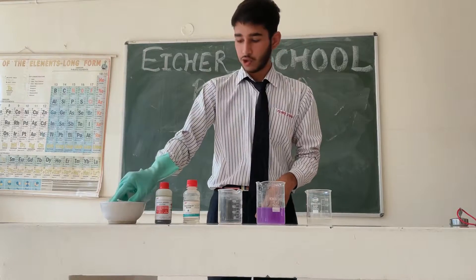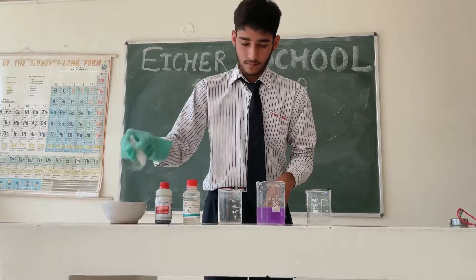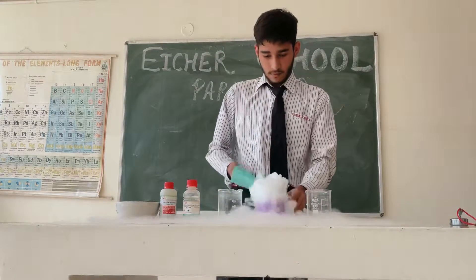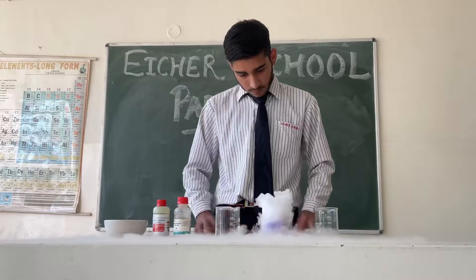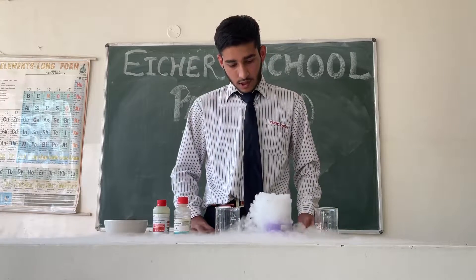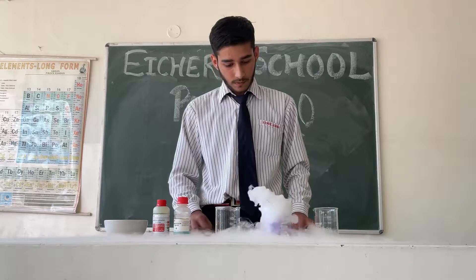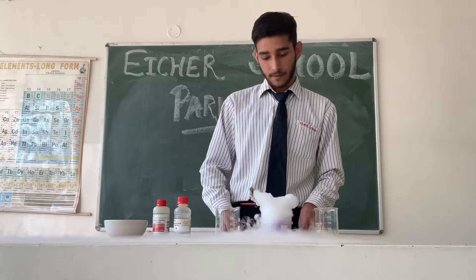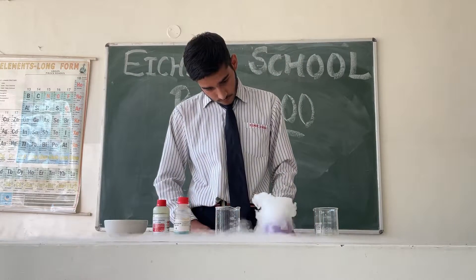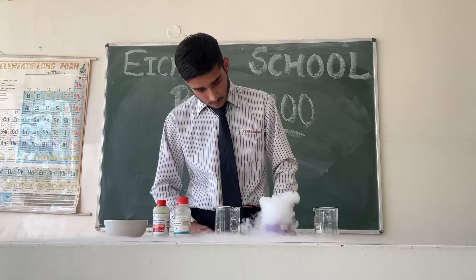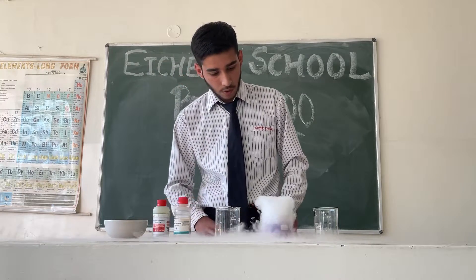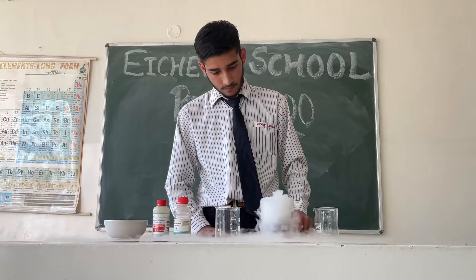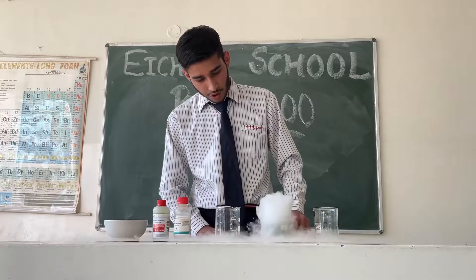Now I will put this dry ice into this solution. The solution slowly turns its color from violet to yellow, which shows that the solution has turned acidic. The solution then turned blue, and now the solution is green.